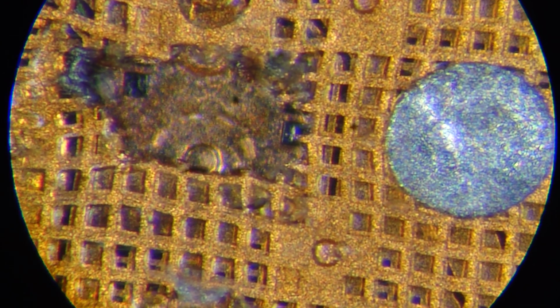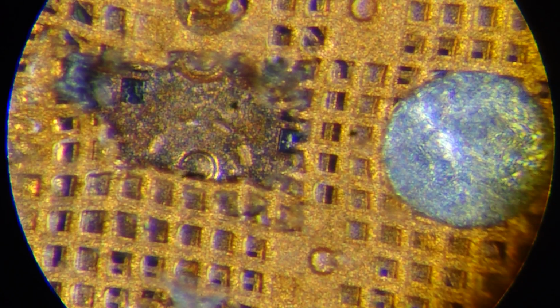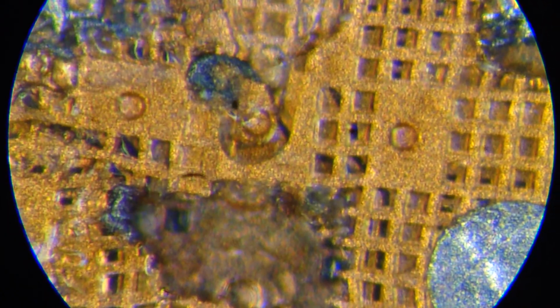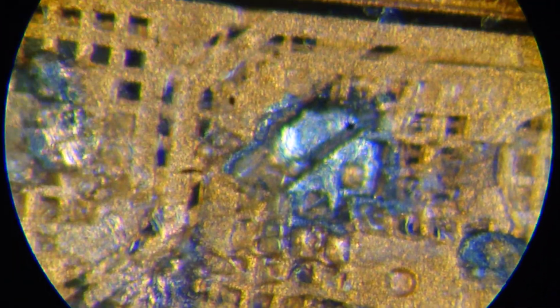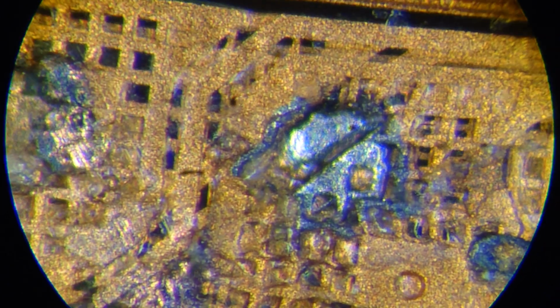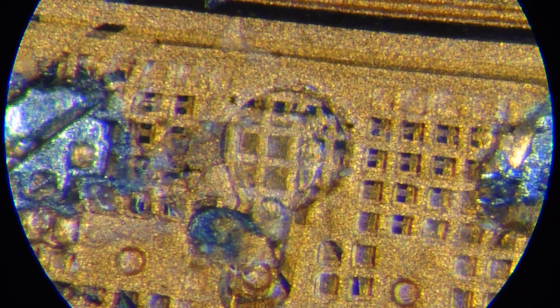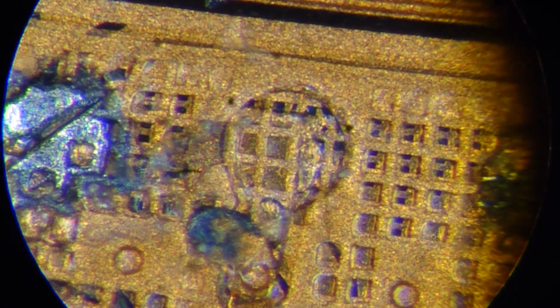So you can see that those two layers just require our refocusing. You can't see them both sharply. Only one layer is seen sharp, while another is seen fuzzy. It should be that way because our objective has a huge aperture.